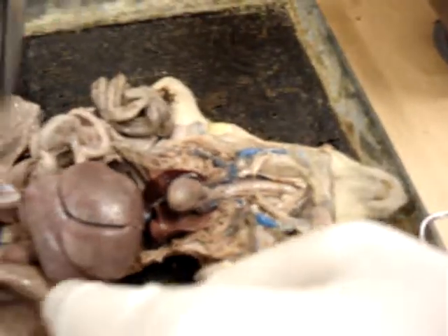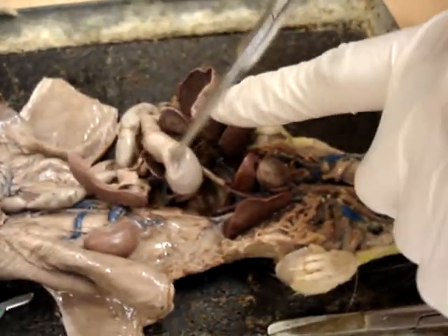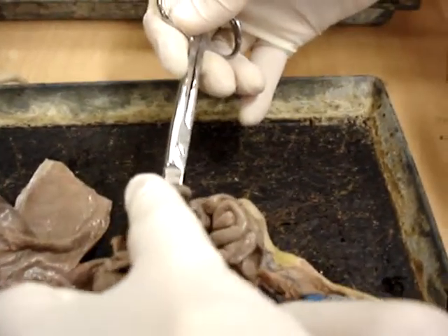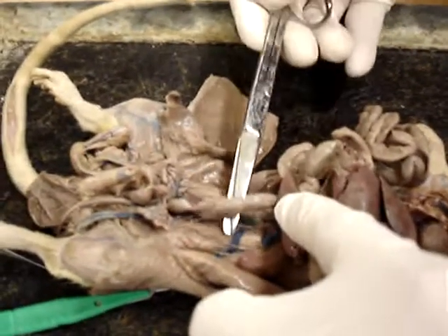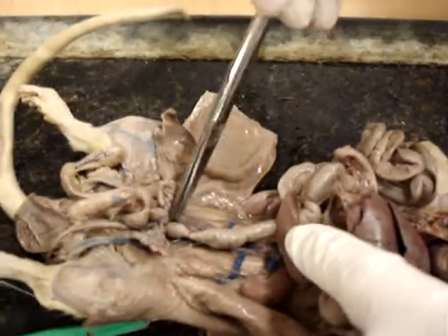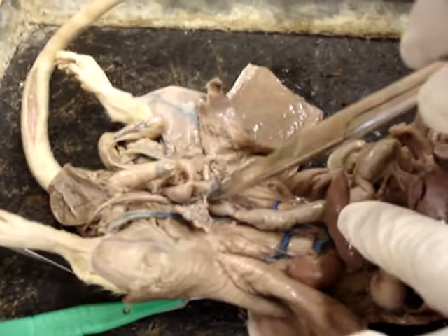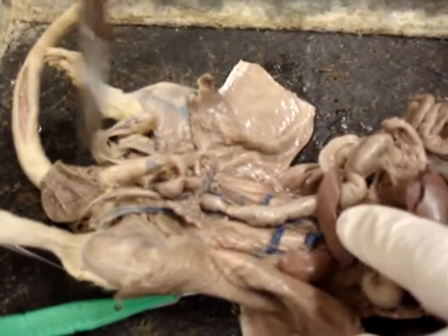The stomach would be right here — this is the stomach. The small intestine would be the small little clusters of things here — these are the small intestines. The large intestine, or what we call the colon, is this part here. The rectum is all the way down near the anus. The anus is where the feces come out.